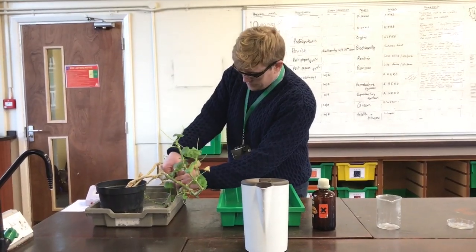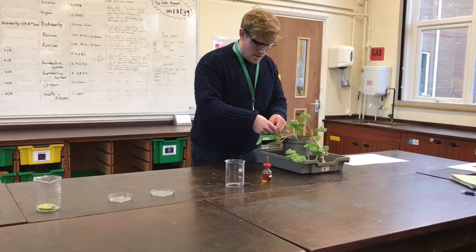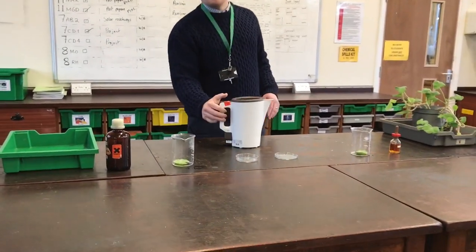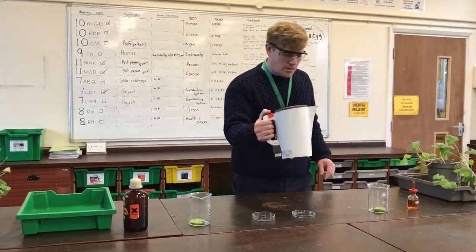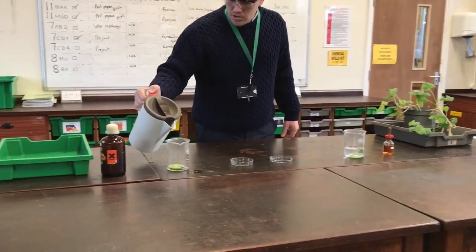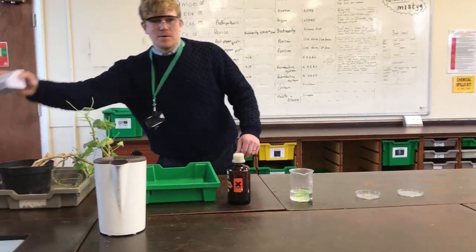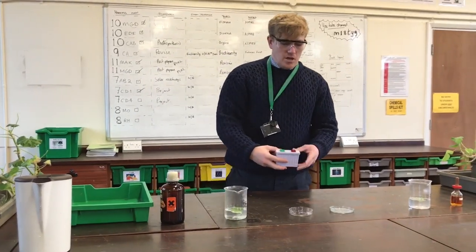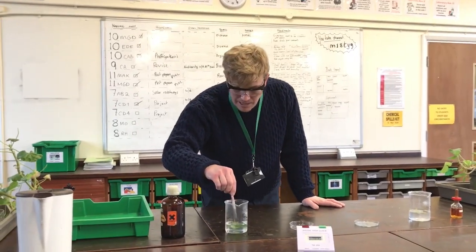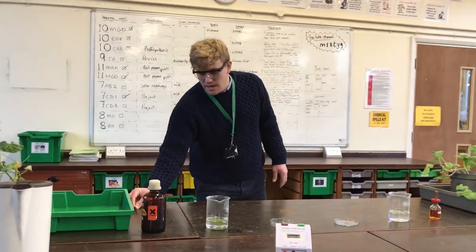I'm going to take a leaf from my light area — nice, good sample there — and I'm going to get a leaf from my dark area. There's a boiling kettle I got ready earlier; you can do this on the Bunsen but it takes a long while. I'm going to use a boiling kettle. This water has just boiled — I'll put about 100 to 150 millilitres of water in there. We have our stopwatch and I'll start the timer — that'll be one minute of boiling the leaf.